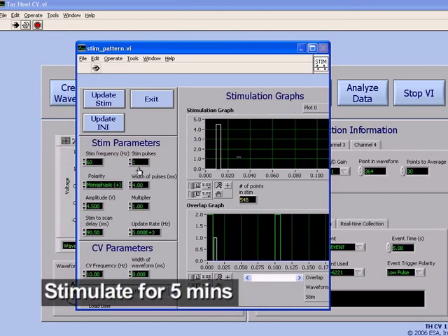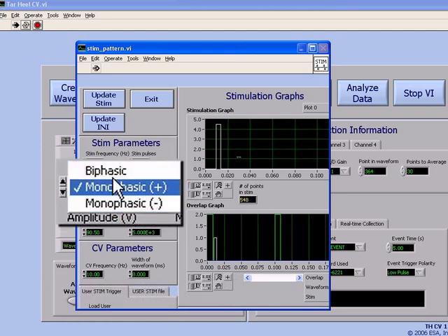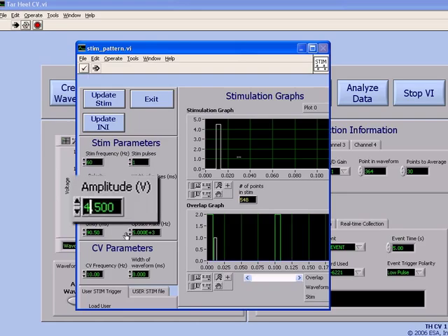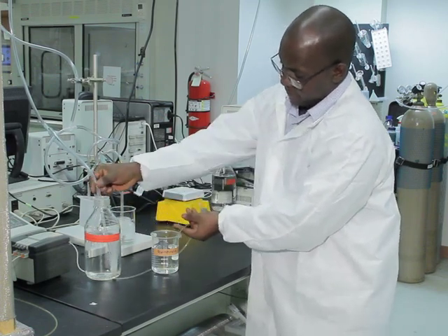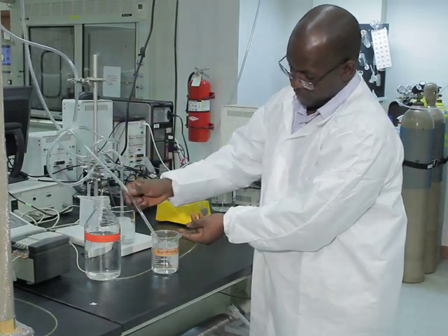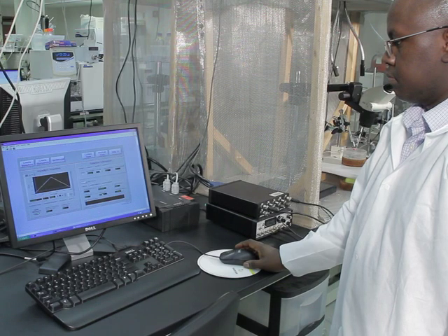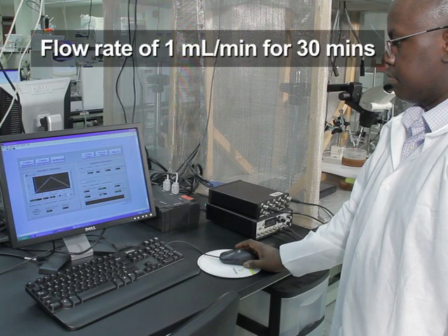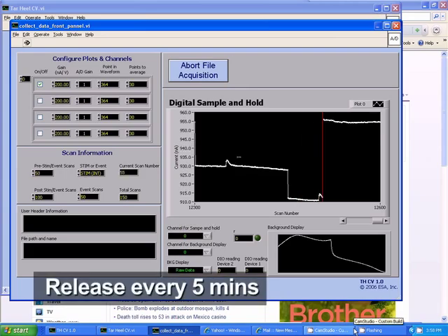Stimulate the slice every five minutes and make the voltammetric measurement of the resulting dopamine efflux for 15 seconds each time. After at least three stable electrically stimulated dopamine release recordings — defined as less than 10 percent difference between peak heights — switch to perfusing the slice with ACSF containing the pharmacological agent of interest at a flow rate of one milliliter per minute for 30 minutes to obtain maximal effect. Record the electrically stimulated dopamine release every five minutes during the pharmacological perfusion.